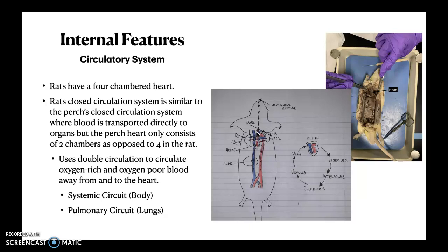So, looking at that, we have our rat, we have all the systems, and yeah.